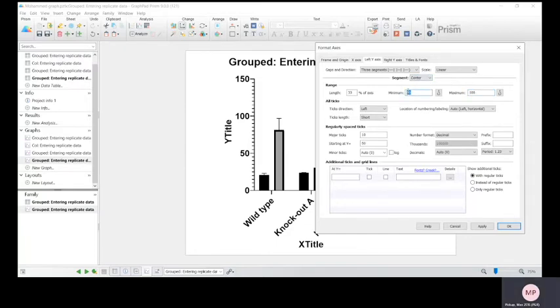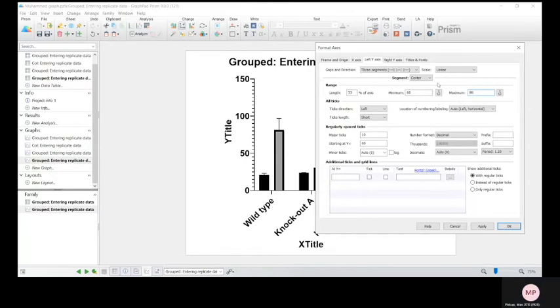Middle, say we want a break between 40 and 60, so start again at 60, come back at 80, and then the top, let's say 120, 150.